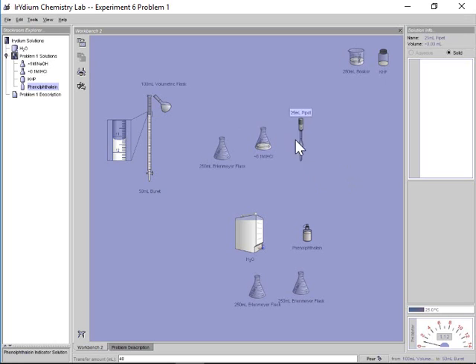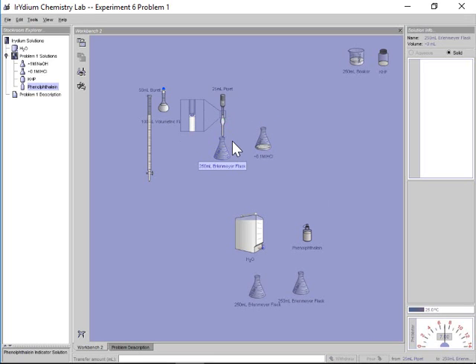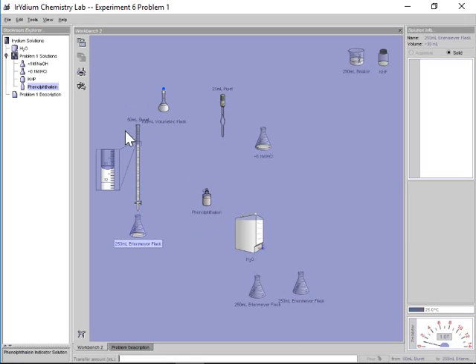What I'm going to do here, I'm going to pipette withdraw 25 mils, just like I did before. This, they tell me, is roughly 0.1 molar HCl. I'm going to dispense it into the Erlenmeyer flask here, dispense in the 25 mils. Don't forget to add the phenolphthalein. So add the phenolphthalein inside. Phenolphthalein and acid is still colorless, no problem. And now we're ready for titration. I double checked, make sure I've actually recorded down the initial volume. Yep, 11.22. And then now I'm going to toss it in.